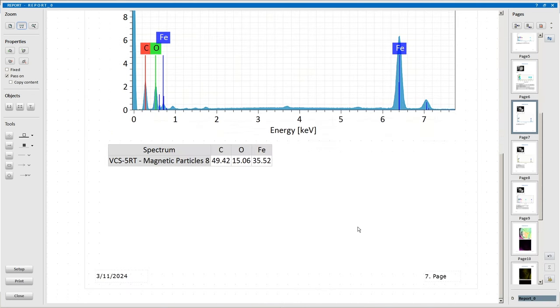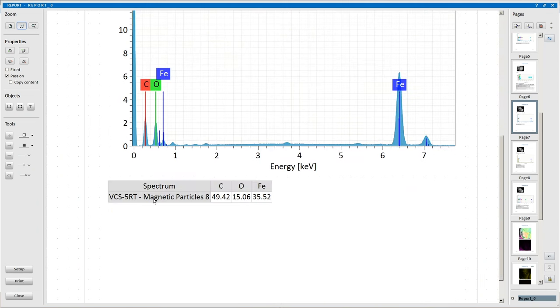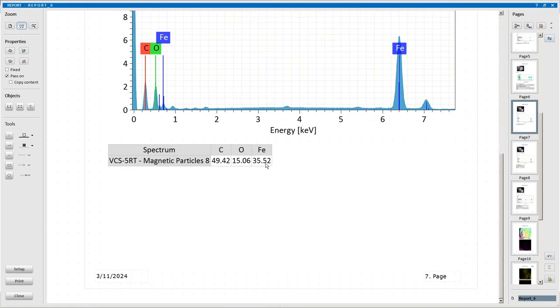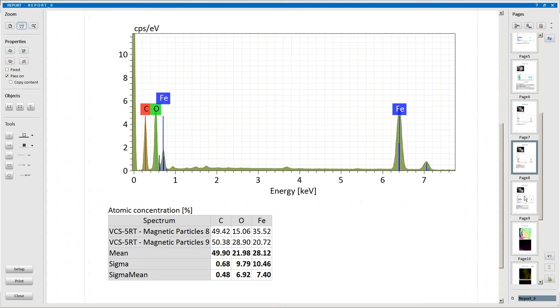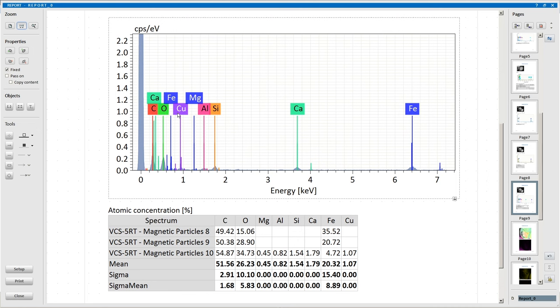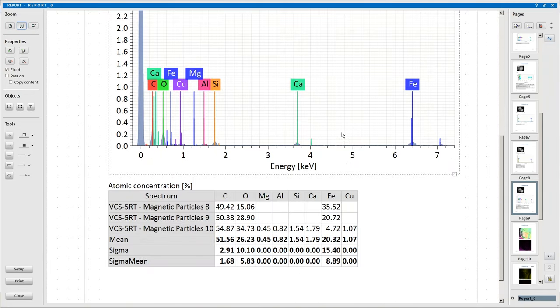In places, yeah. So the skin here, whichever one this is, yeah, the skin, 35% iron, 15% oxygen, and the balance is carbon. And here, similar kind of thing, but inside, iron, copper, magnesium, aluminium, silicon, calcium. And iron is mostly a single isotope, isn't it? 56, is it? No, I don't know. That's what I want to do now, when I wanted a reliable source of these things.